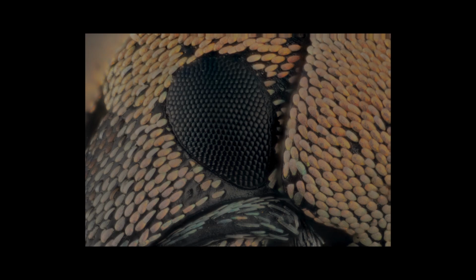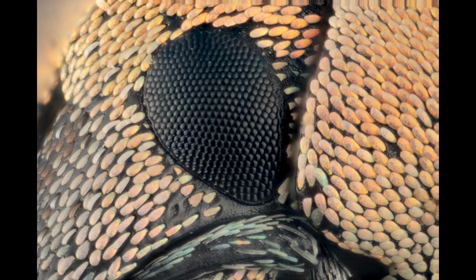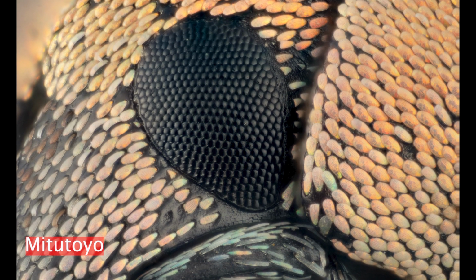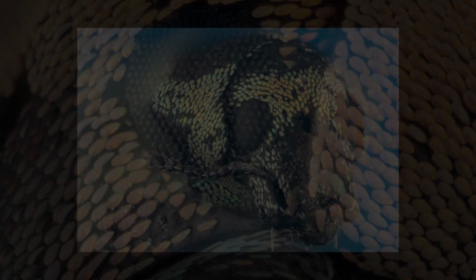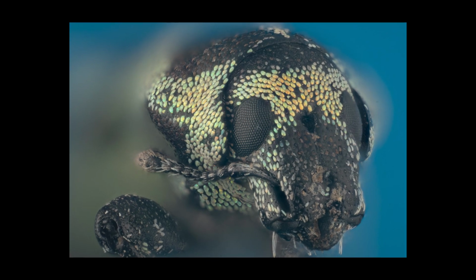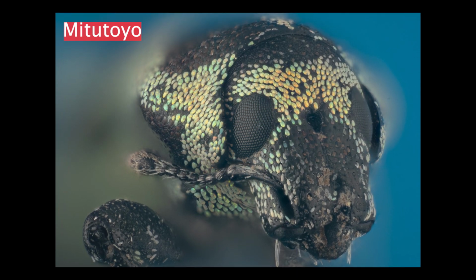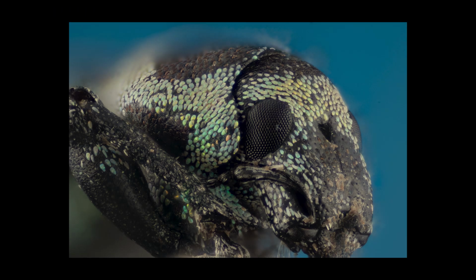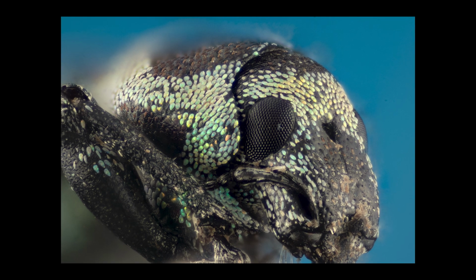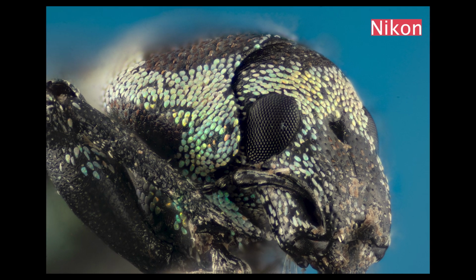So let's have a look at the photographs. There is probably more to be learned by looking at the photographs that I've taken since I did the comparison. And let me explain what I mean by that. In an attempt to keep everything equitable in this comparison, I tried to use much the same shooting conditions for each of the objectives, and the result was, of course, that I was using lighting I had to use with the Nikon because of its short working distance, and then I was imposing that restricted lighting on the Mitutoyo images.